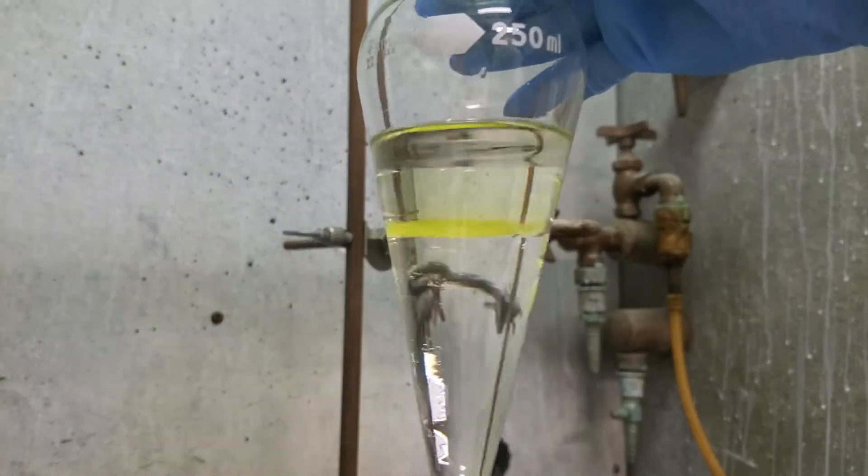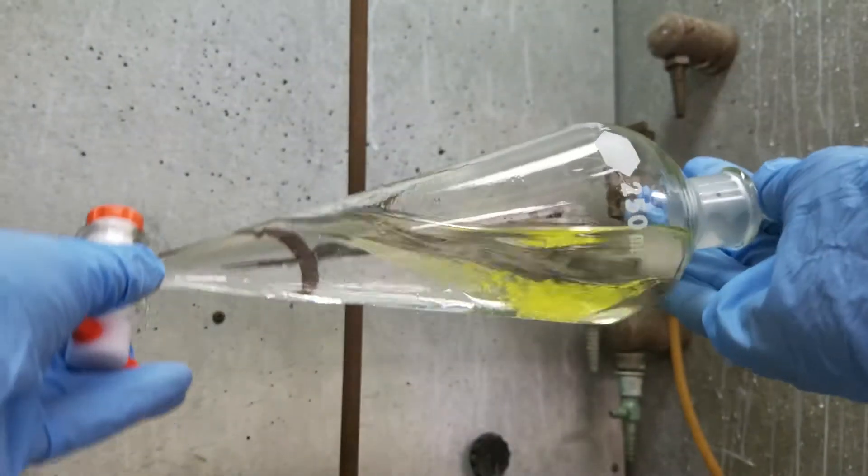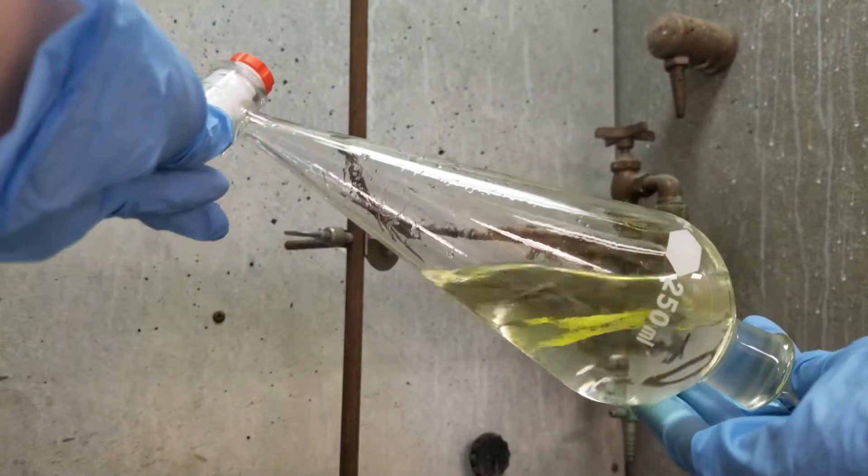Place the stopper in the separatory funnel. Securely pick up the funnel and invert, keeping one hand on the stopper to make sure it's securely in place.